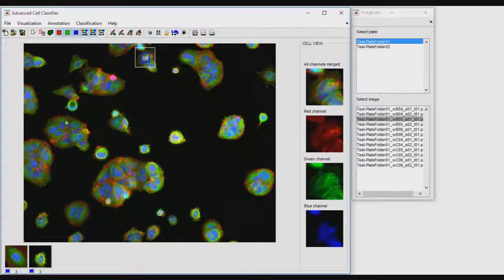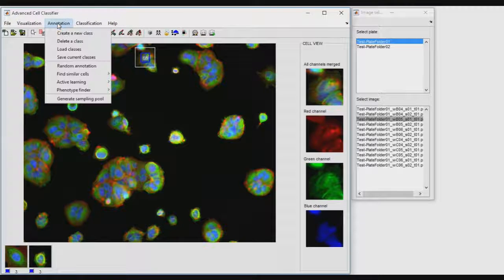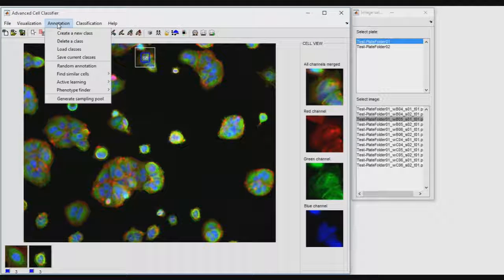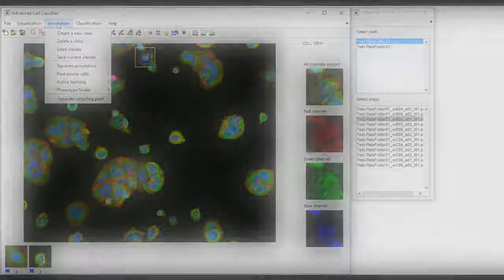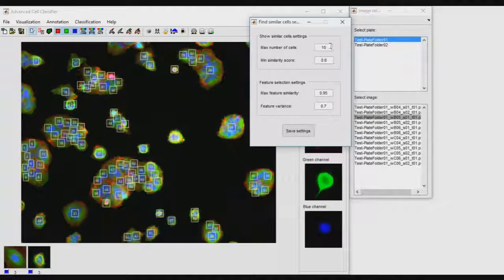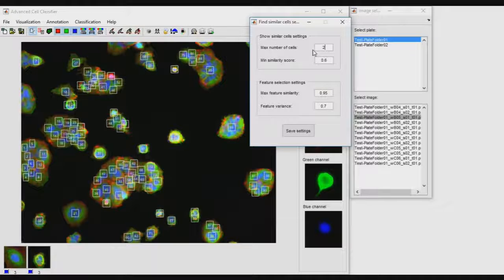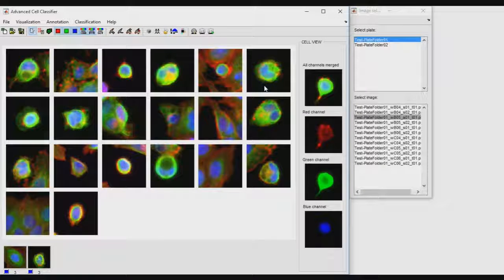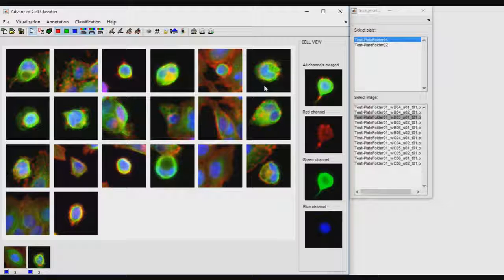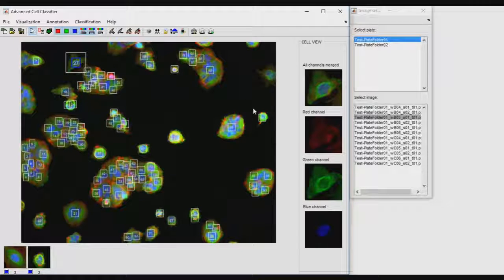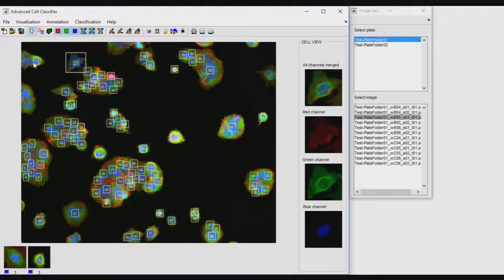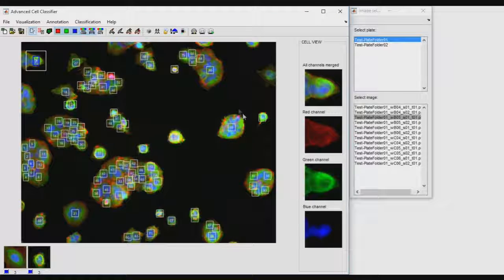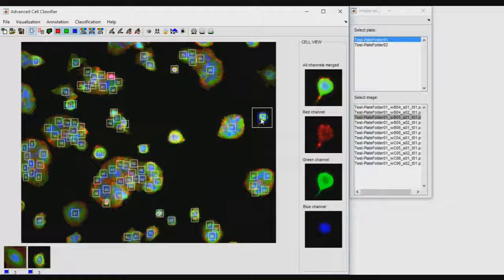Advanced Cell Classifier provides several methods to find classes of interest and annotate cells into classes. For instance, find similar cells shows cells with similar characteristics to the currently selected one and can be useful in increasing the number of annotated cells. Active learning automatically shows cells that are the most difficult to classify and improve the precision of the classification most. Phenotype finder analyzes the space of non-annotated cells to propose potentially interesting novel phenotypes.